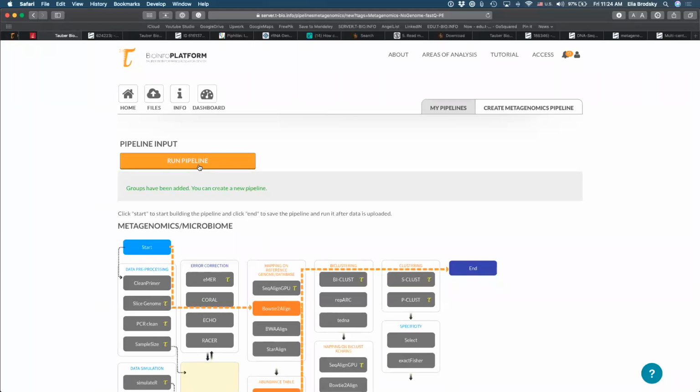This is just one of the first methods that we're exploring. There's going to be a few other things that we will do. But for now, please keep it to a small number of samples. Does anyone have any questions about what we did here? Okay, does anyone have any questions about what to do then with the table once you get that table out?